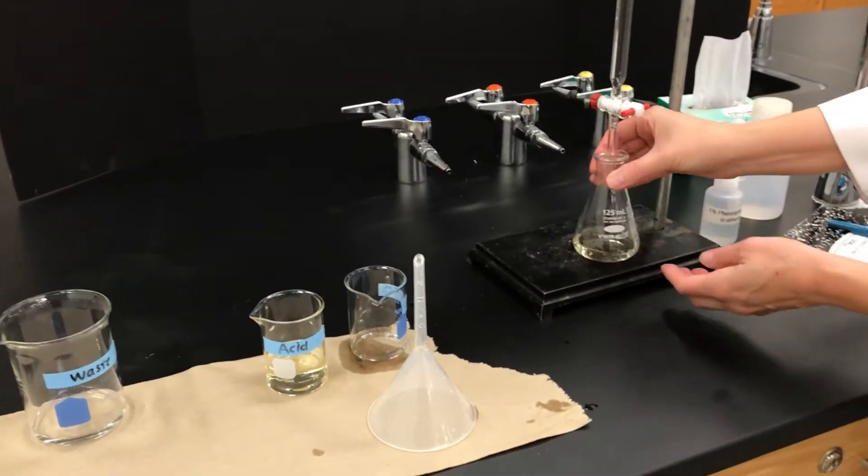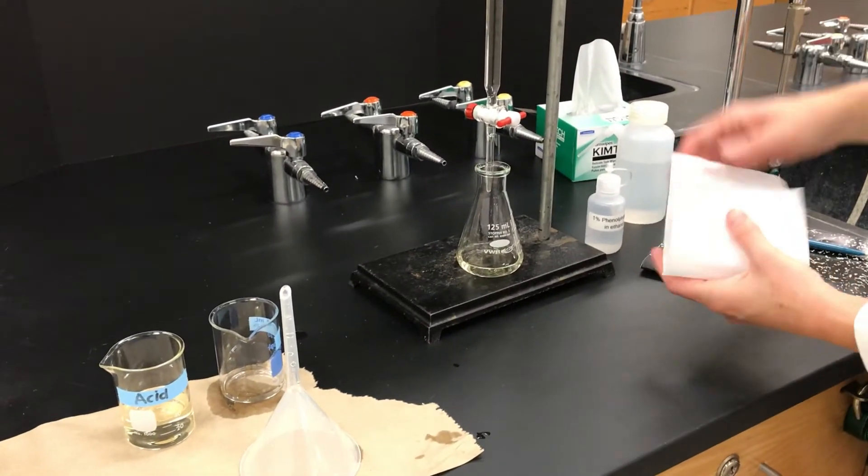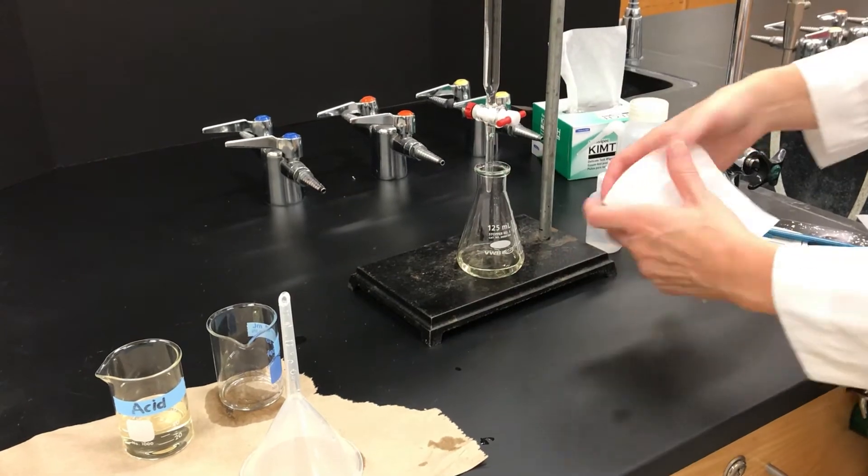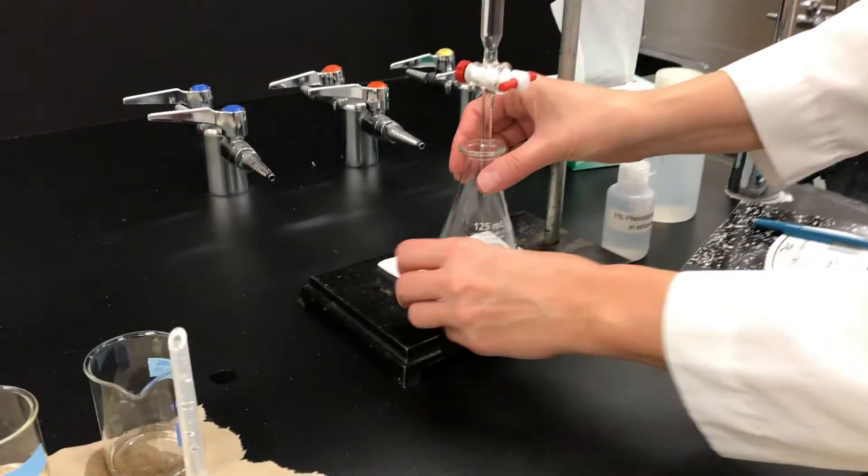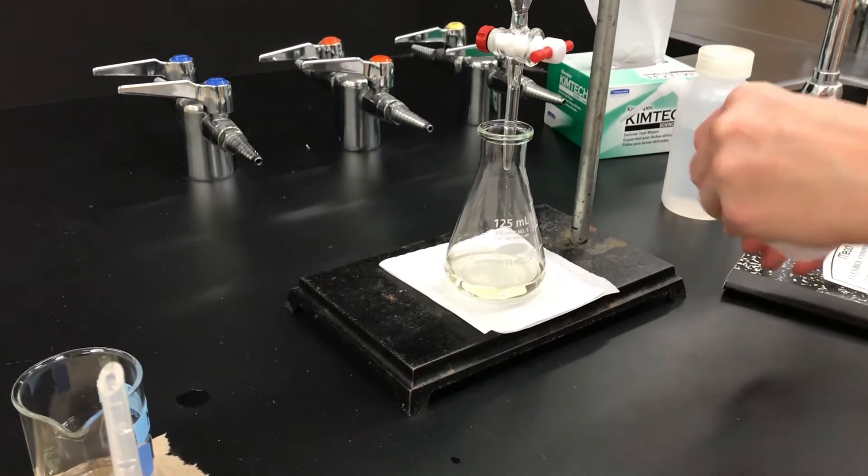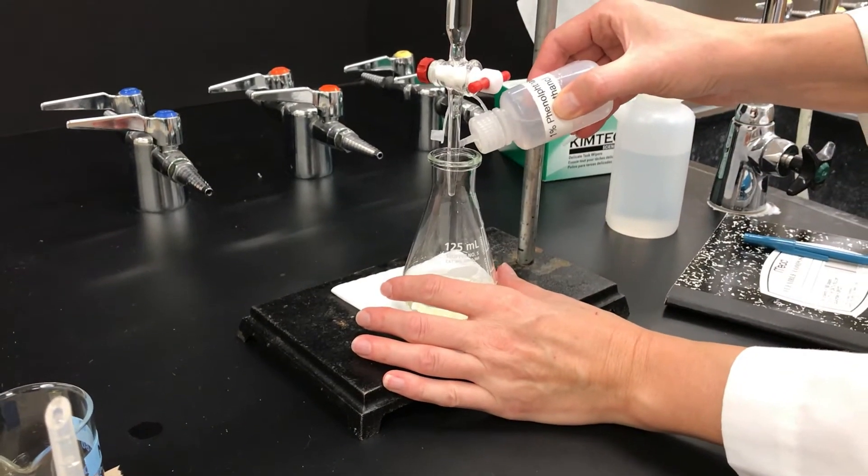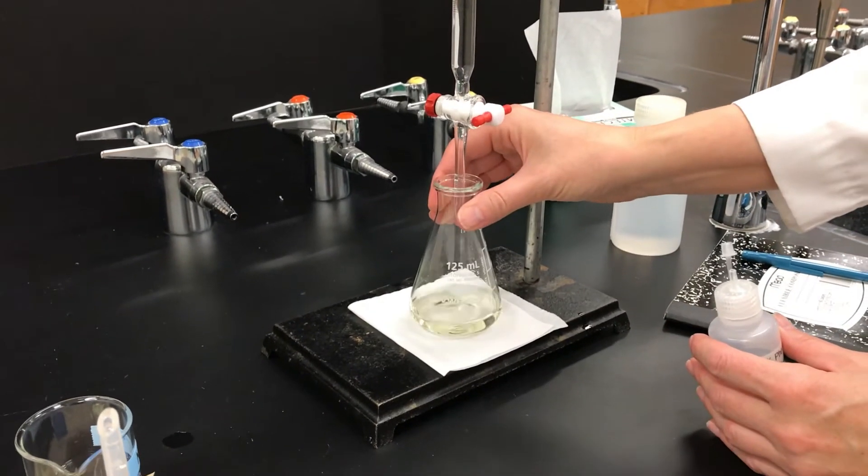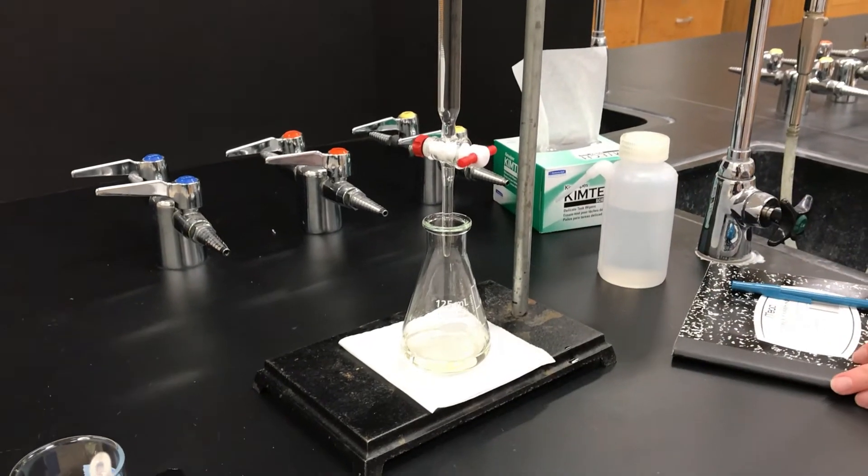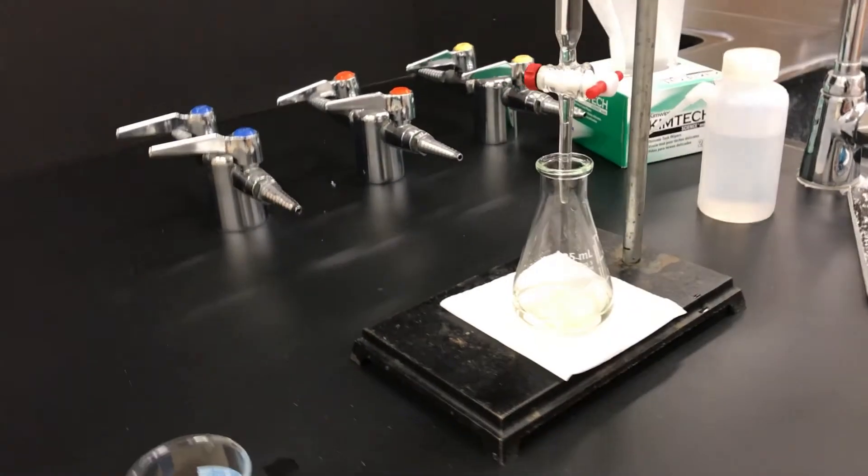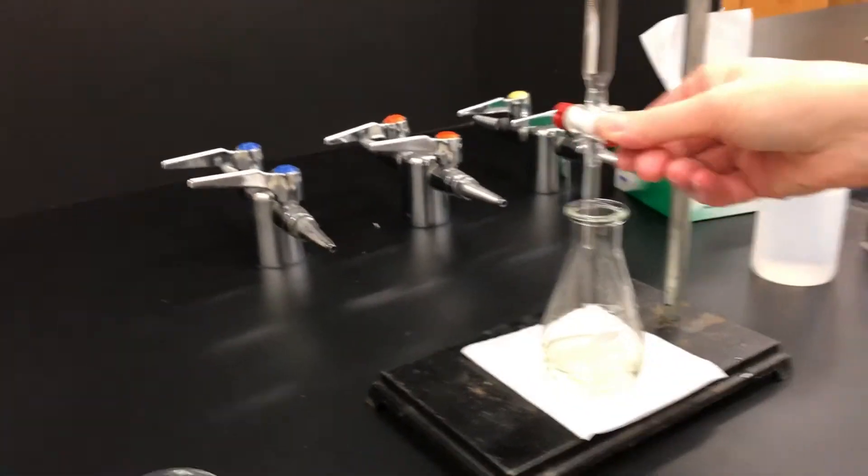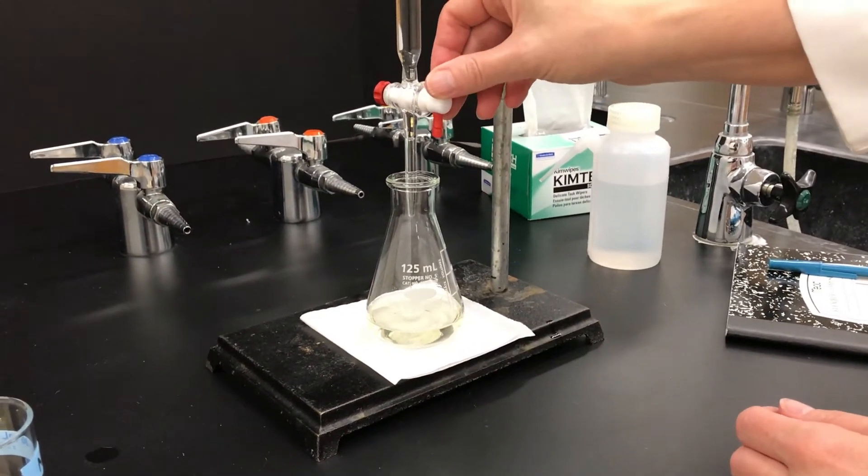Here is our acid that we're going to titrate and the endpoint for the titration is going to be a light pink color which is pretty hard to see against a black background, so we put a white piece of paper or Kimwipe underneath. What I'm adding here is the phenolphthalein indicator. If you don't add that you're not going to get a color change at all and so you won't even know when the titration is over. A couple drops works.